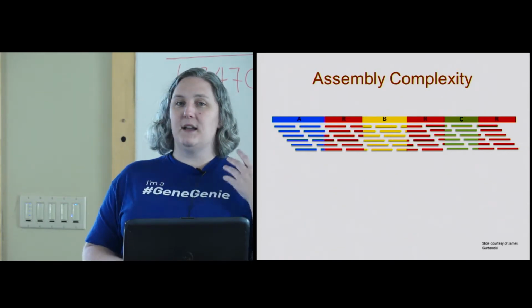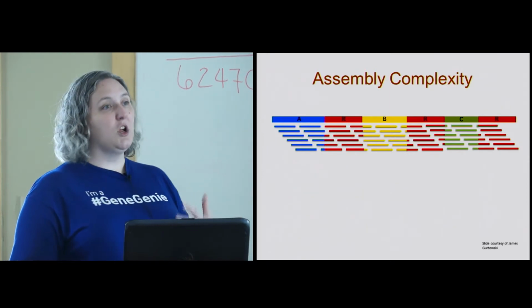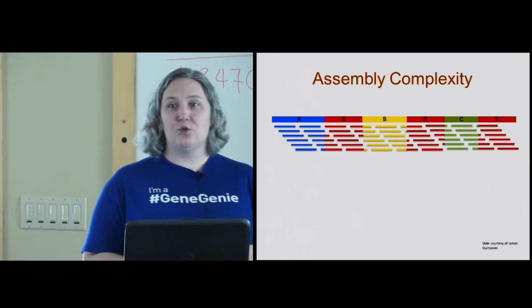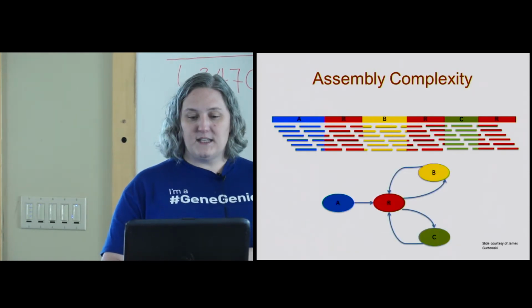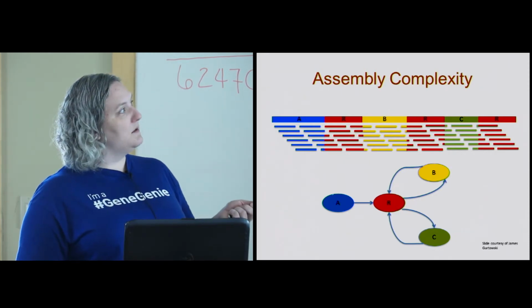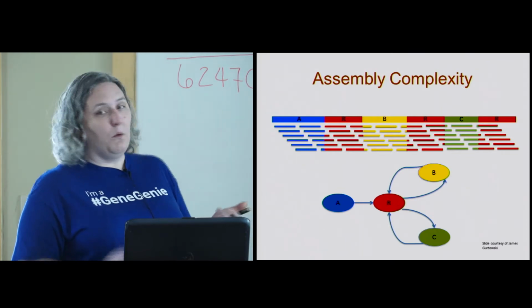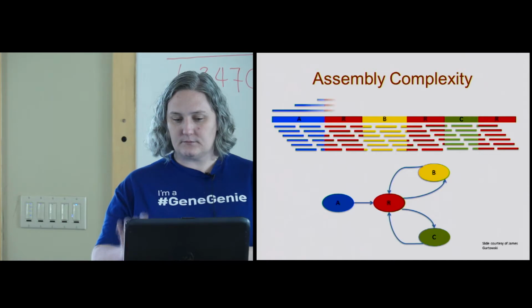Short read sequencing doesn't give us that information. It's very difficult, and we have to have very, very high coverage to get resolution across highly structurally interesting areas at an effective level. This means that we're not confident. How do we go through this order? Is it A to R and then to B? Is it R to C? We don't know. We can't resolve it. So we have a map that's not accurate.